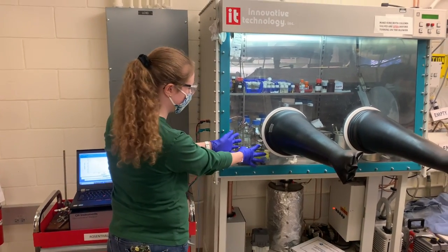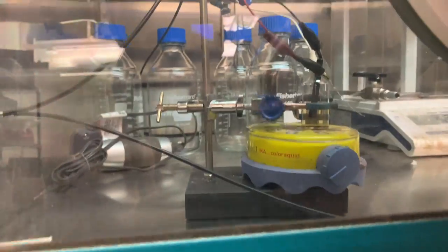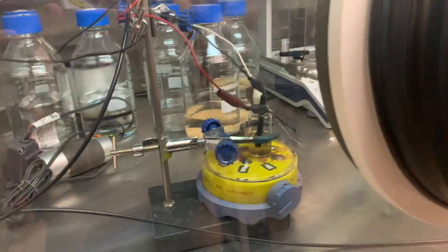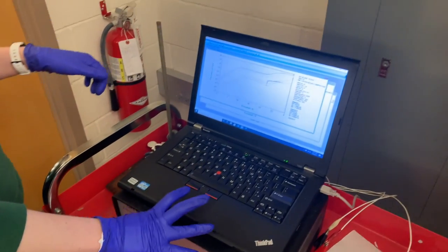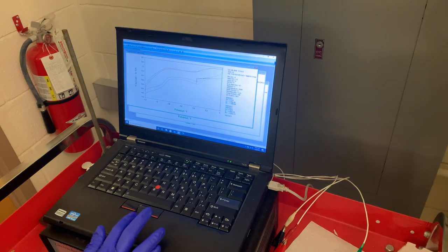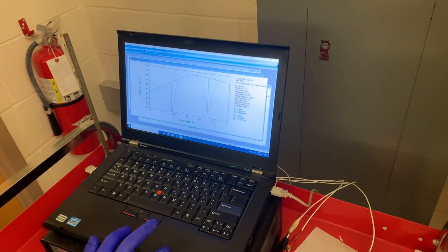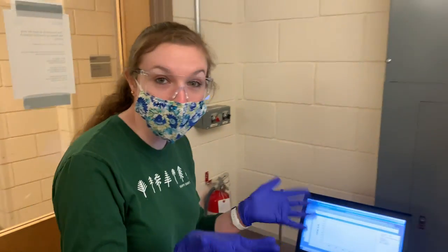So some examples: here we have a setup of a single cell with our connections to the potentiostat. Some experiments that we can do include CV, DPV, and bulk electrolysis experiments for our materials.